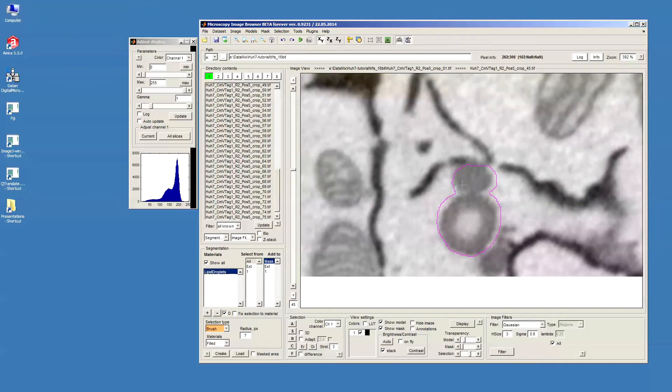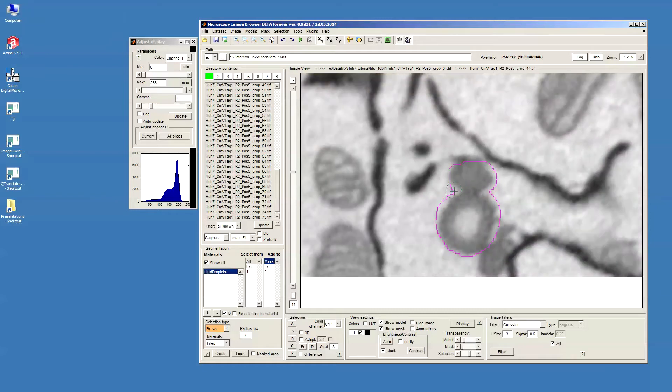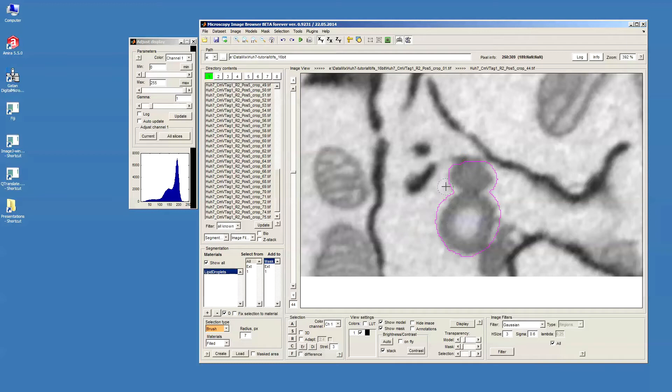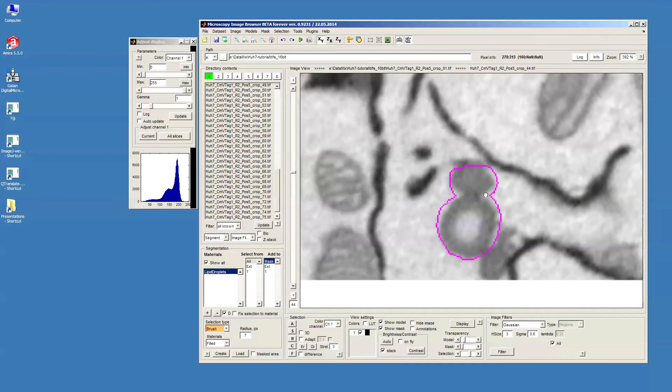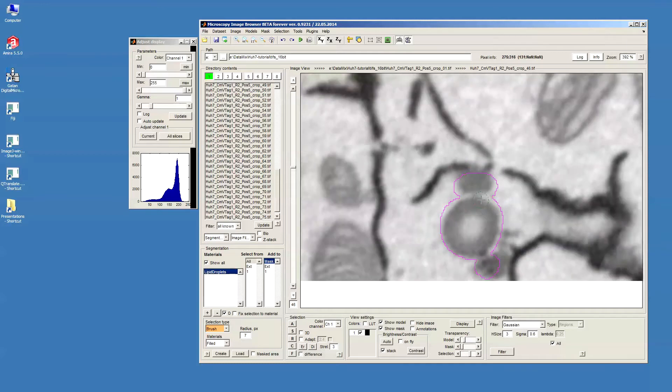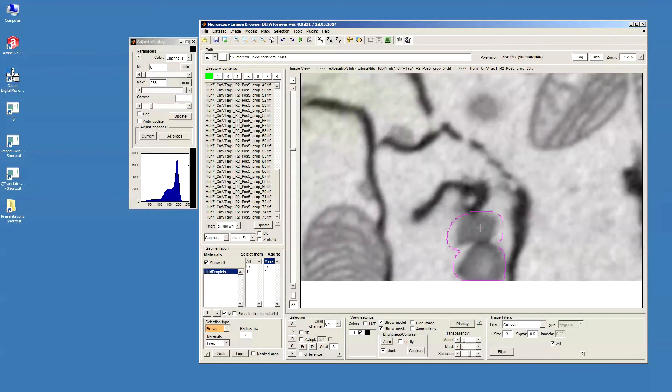When I press A the only thing which happens is that I add the selection which I see for the current slice. If I use Shift+A it will add selection for all slices of the dataset.